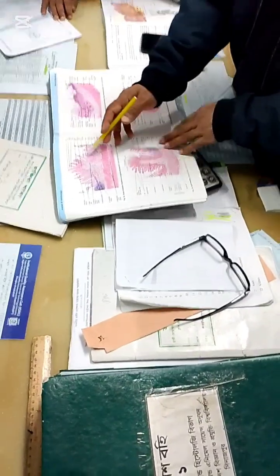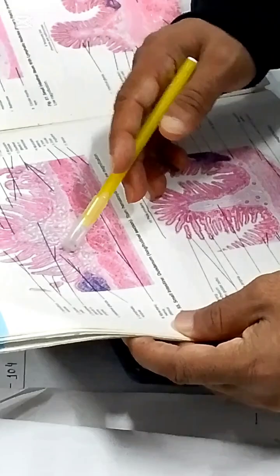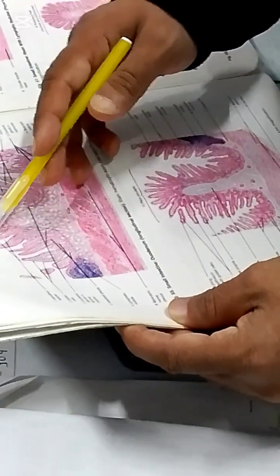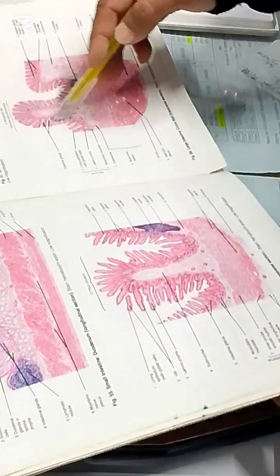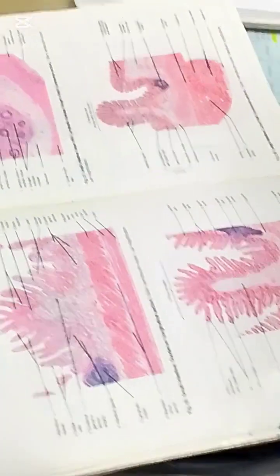Enter into the fold. But here you can see these are villi. This is submucosa, and this is muscularis mucosa. These are absent in the villi. Villi are finger-like, but the fold is not finger-like. This is different.